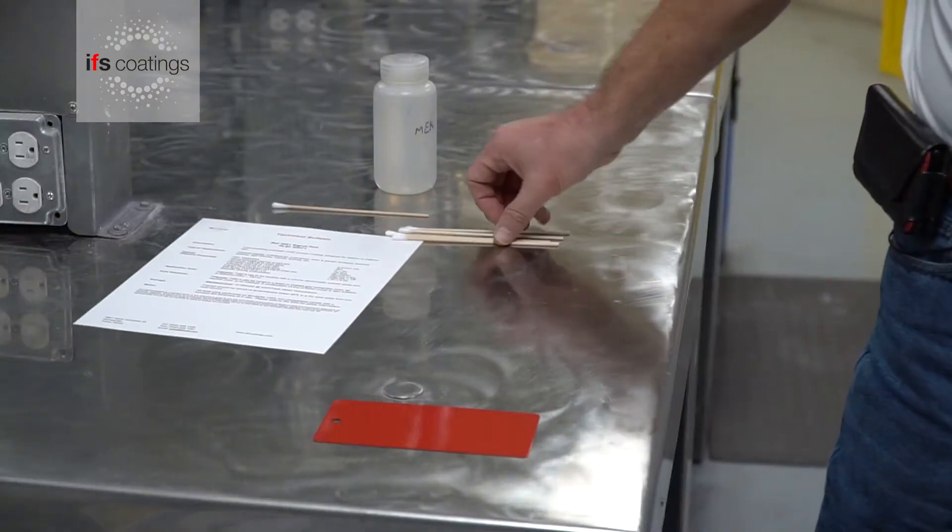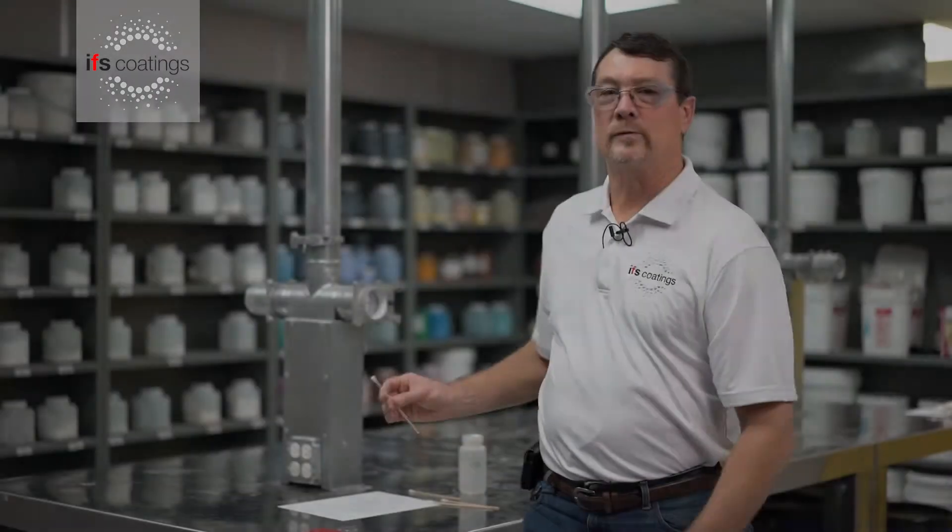The products that we'll be using with the solvent is a Q-tip. We will soak the Q-tip with the MEK and do 25 double rubs.